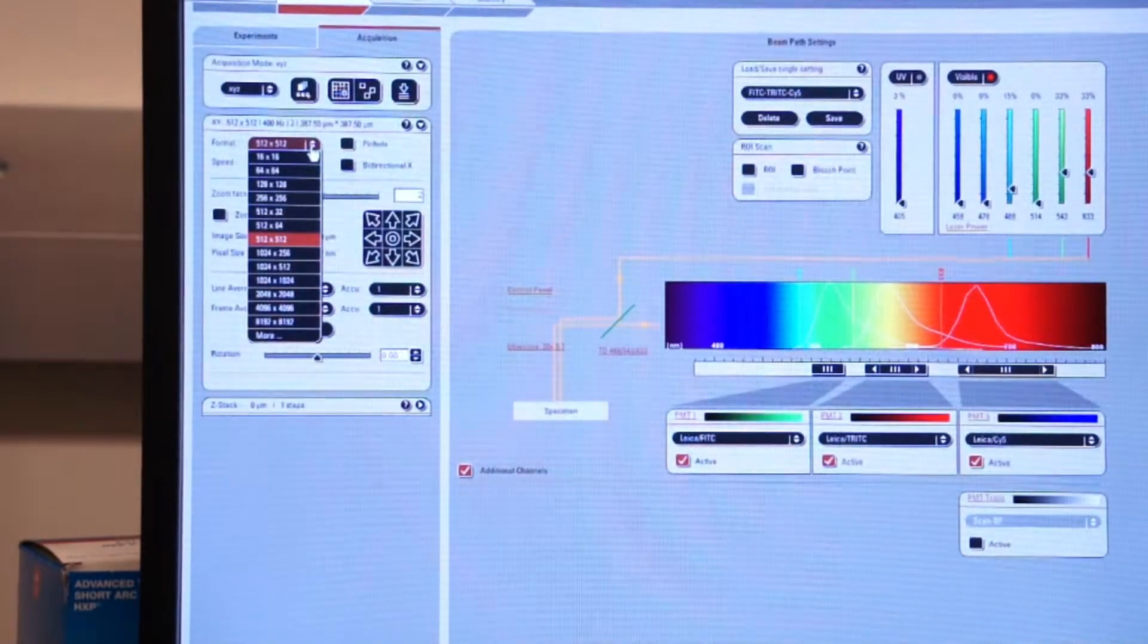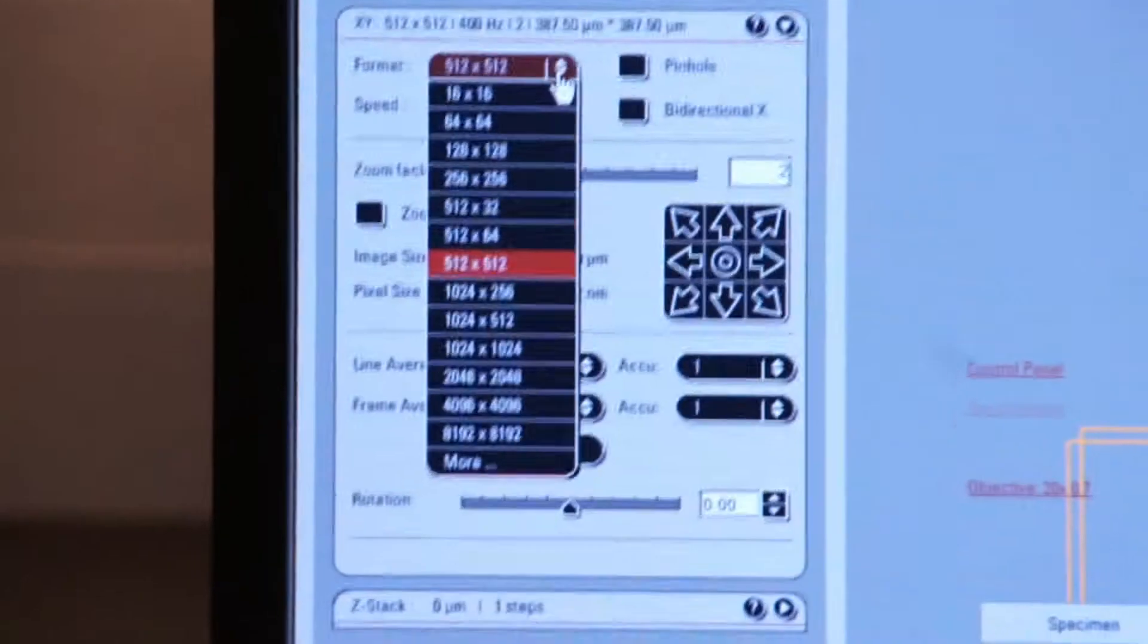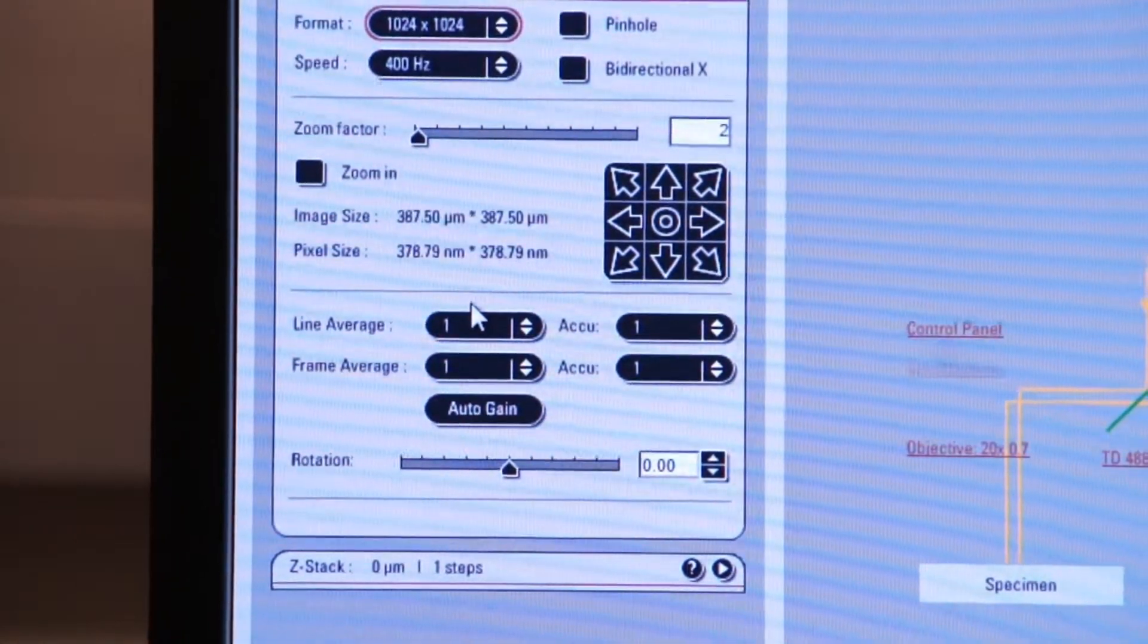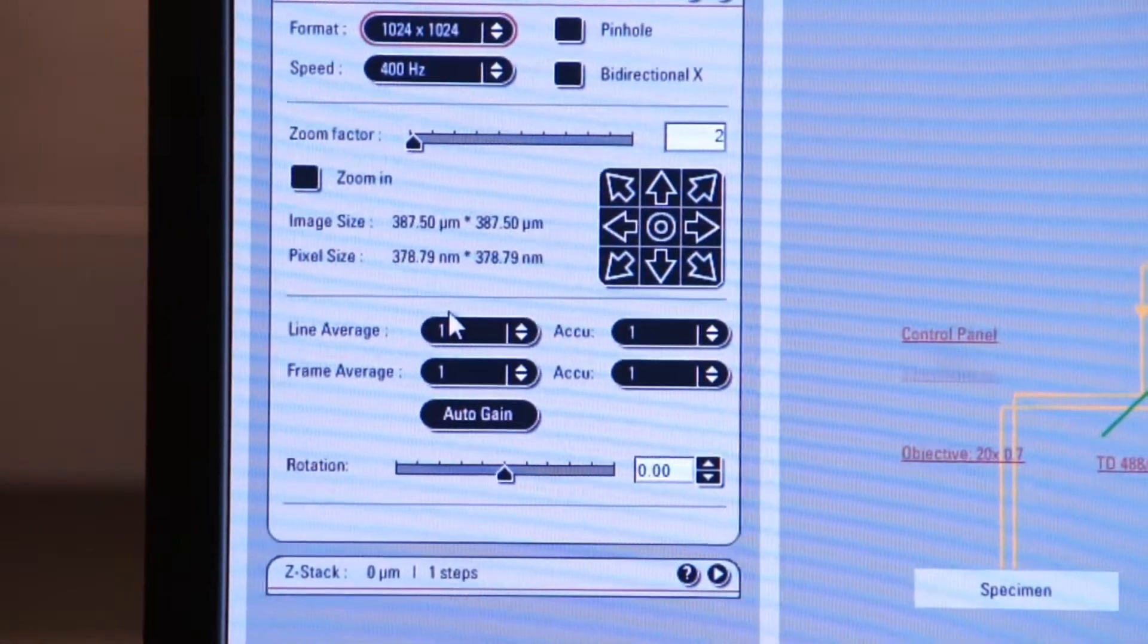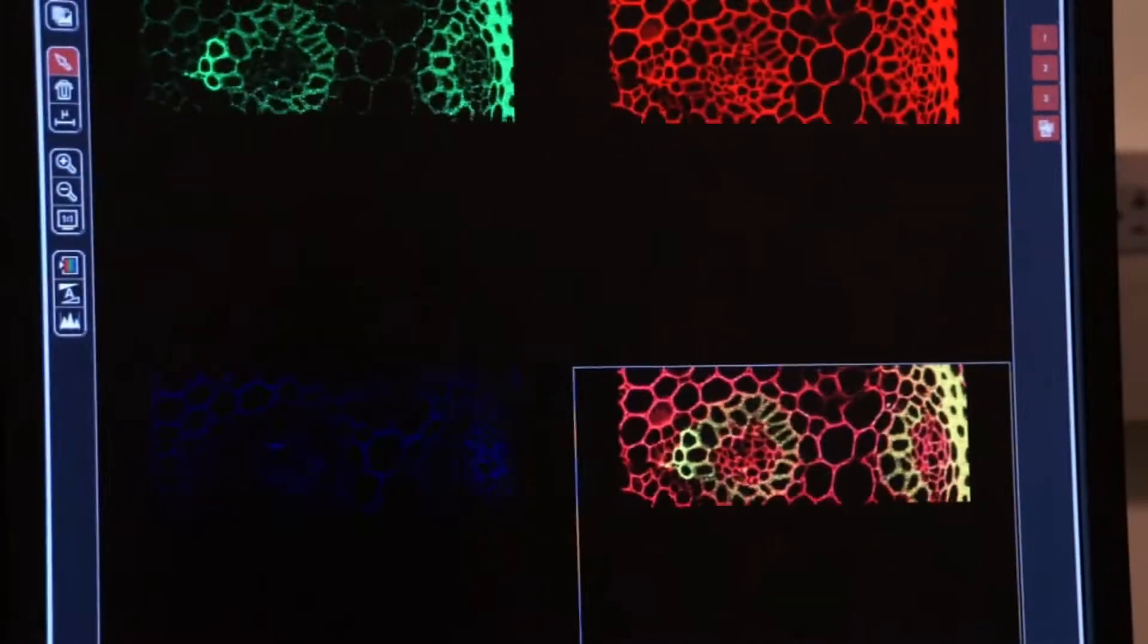I can go back over here to this screen and I can increase my digitizer resolution. So let's go 1024 by 1024. We'll click on capture image again. You'll see the system capture an image.